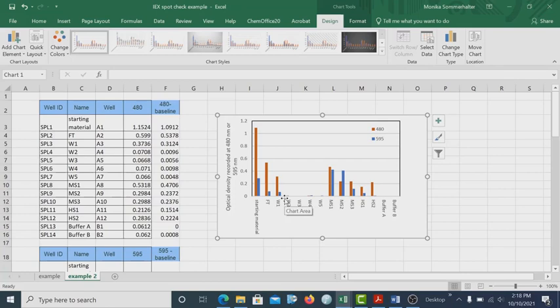The same is true for wash 1, but as you continue to inject more buffer A without any salt, that was the 20 millimolar Tris pH 8, no more protein and no more PPO activity was able to elute from the column.